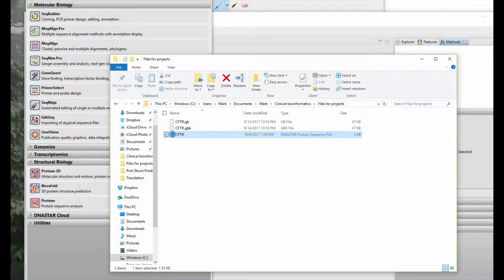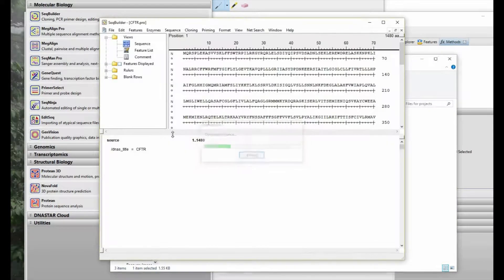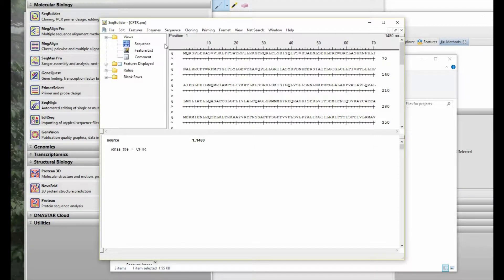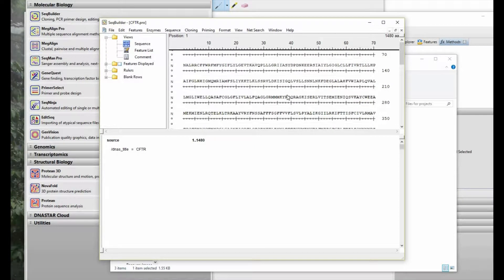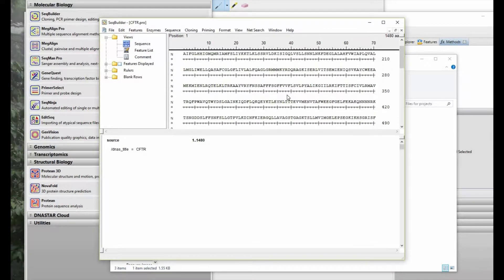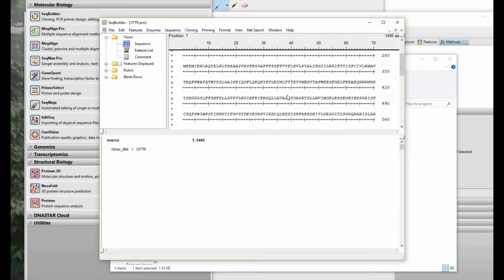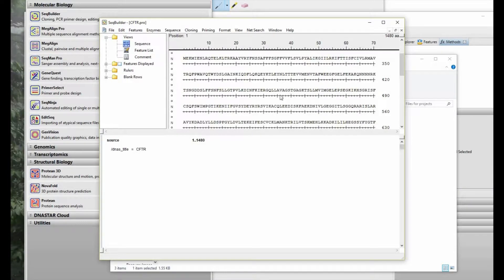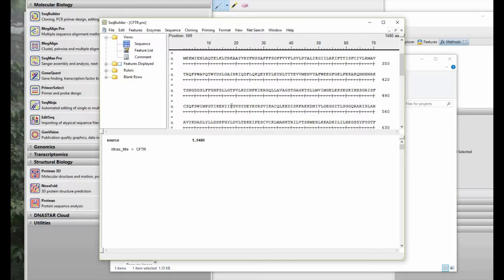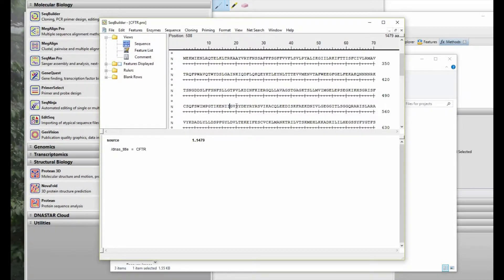For example, in order to create a variant sequence, we open up the CFTR protein sequence in SeqBuilder. We scroll down to position 508, find that position, highlight it, verify that we have the correct position 508.